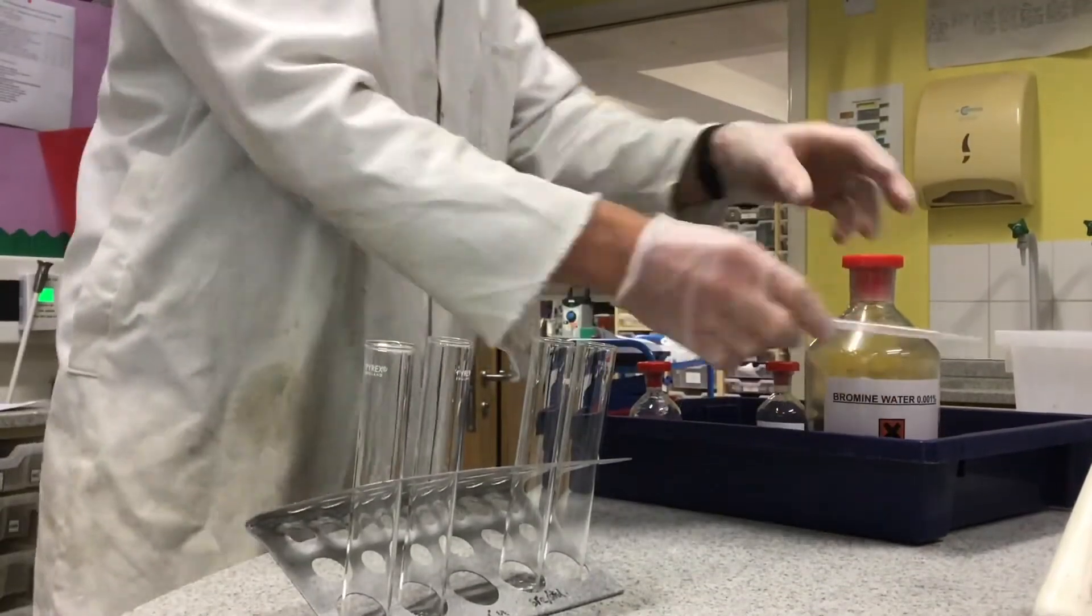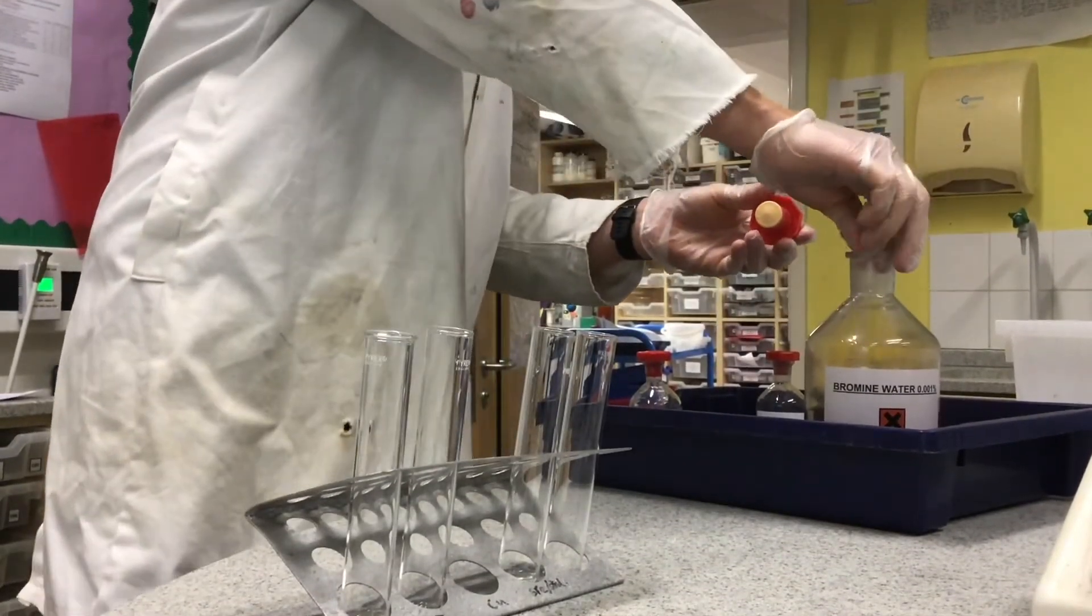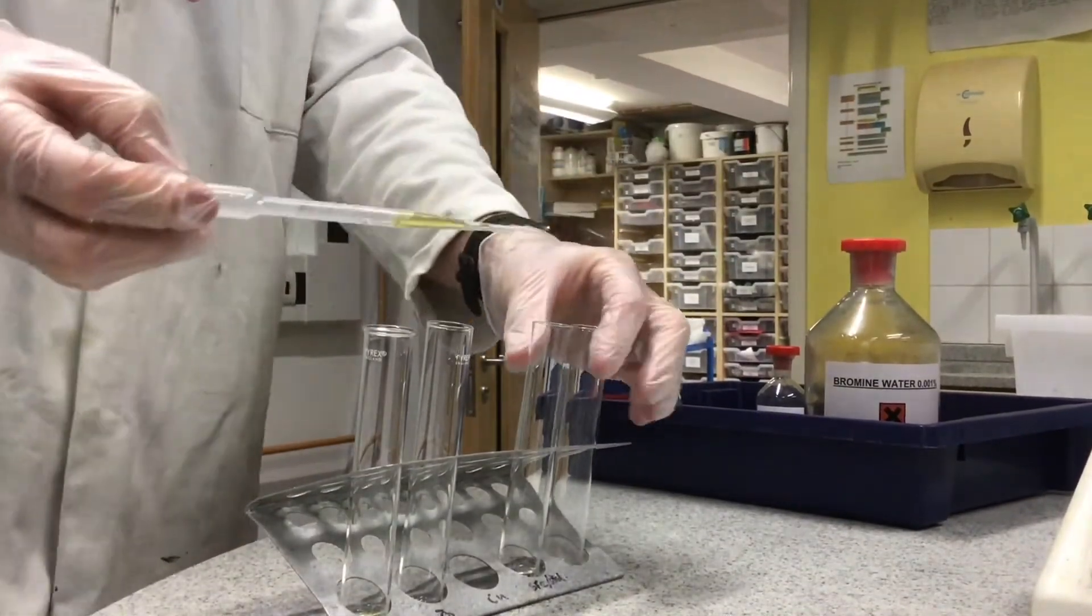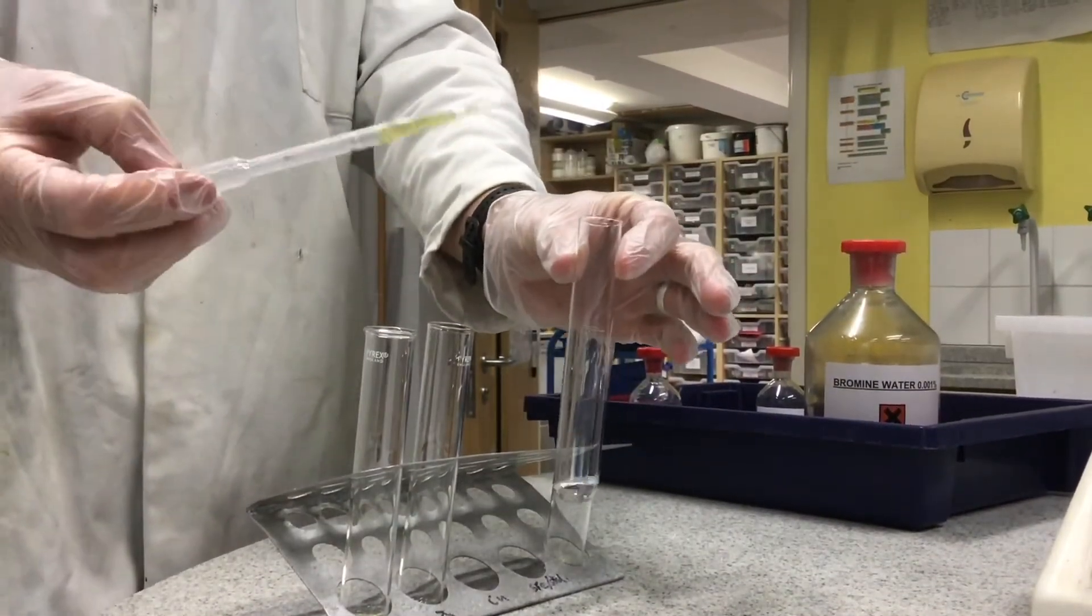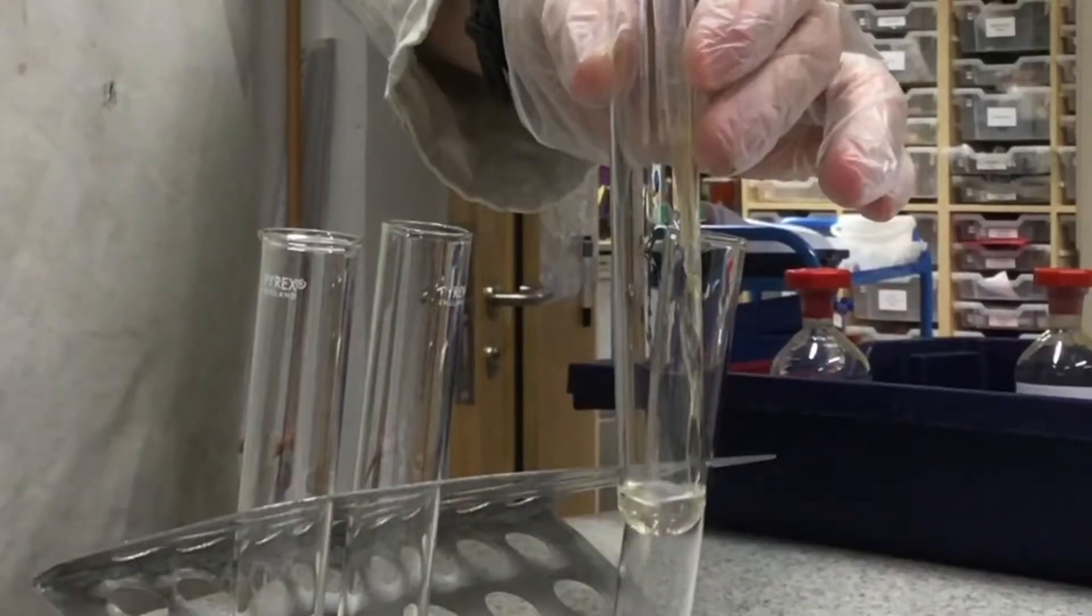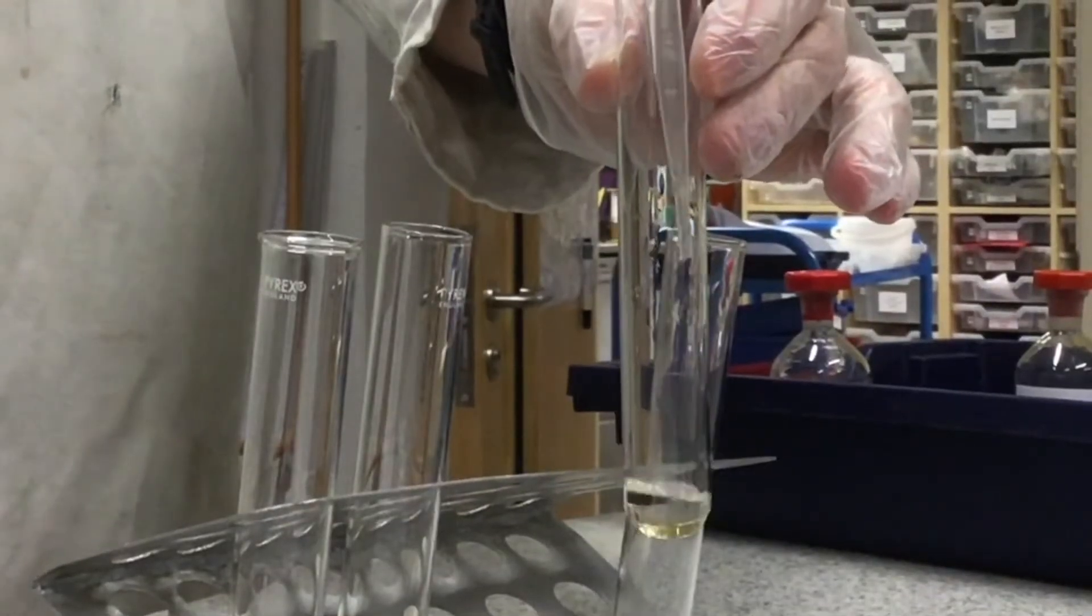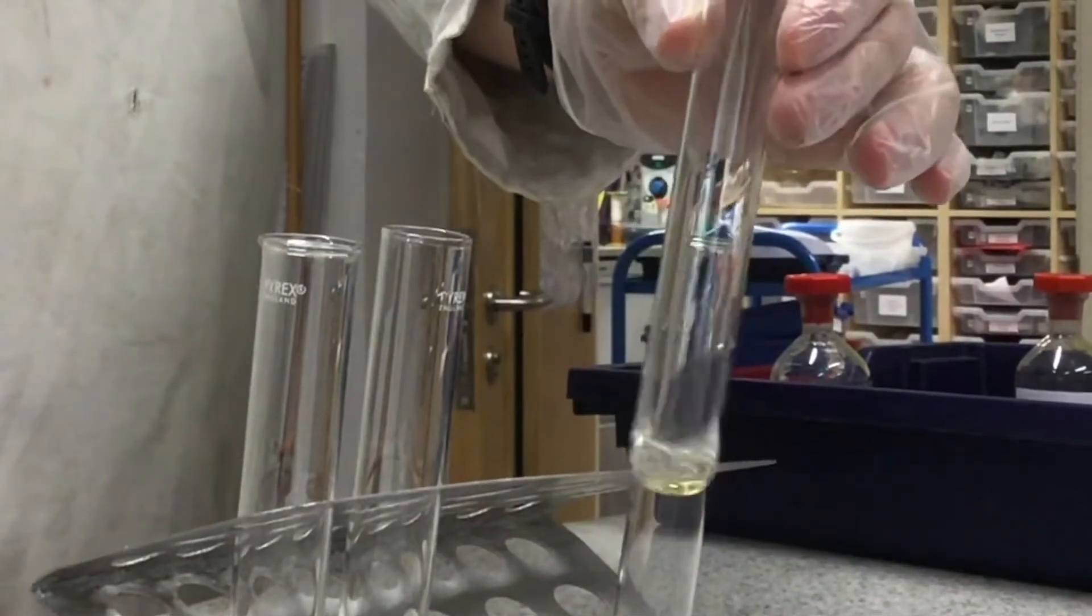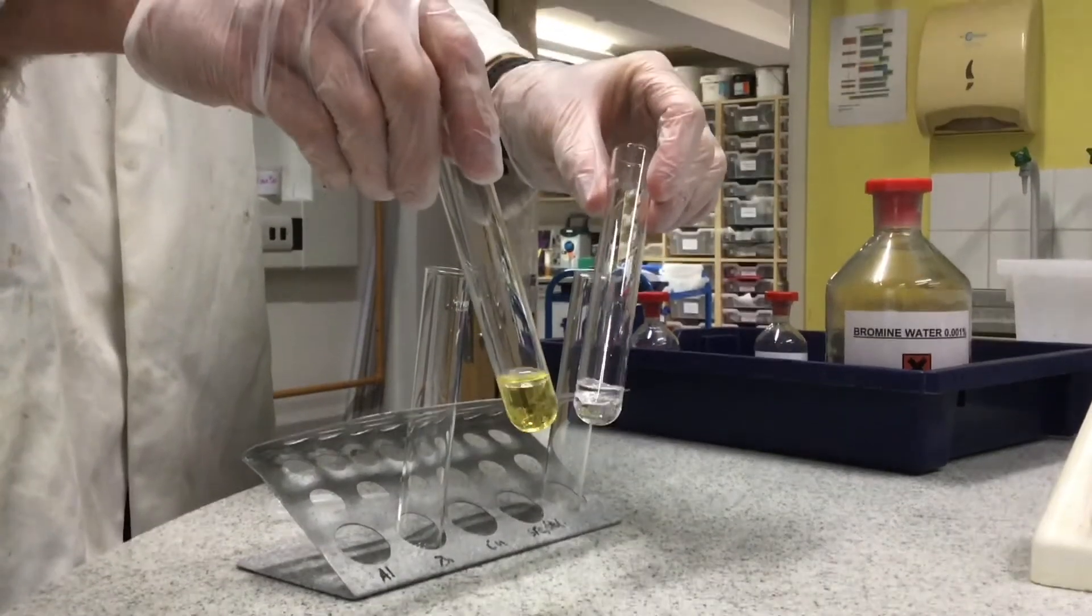So how you can identify an alkene is that when you add bromine water to an alkene there will be a color change. So you pour that in, drop, drop, drop, there is a chemical reaction occurring and therefore the solution goes colorless.